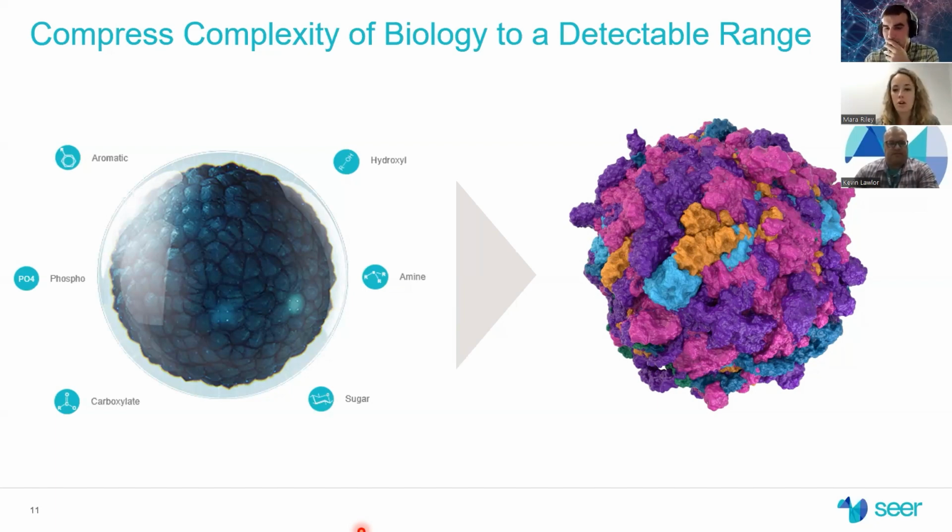And another thing about our nanoparticles is that it's a common misconception that we're targeting or we're looking for specific proteins. That's not what it's actually doing, because we can use different nanoparticle corona formations. We can go after classes of nanoparticles, and that allows us to look at the albumins, but also the chemokines that are in the sample.